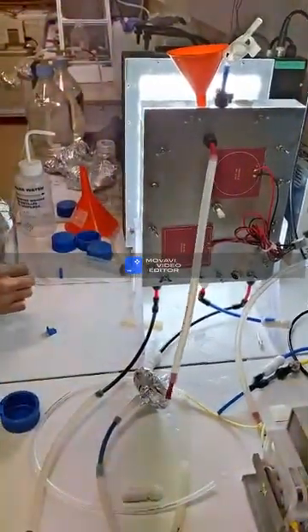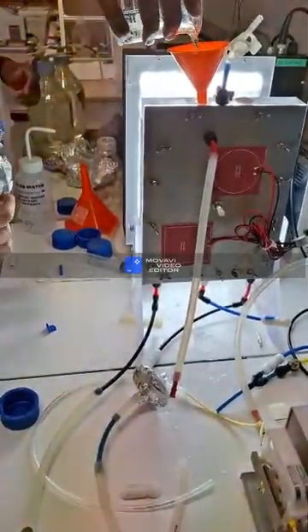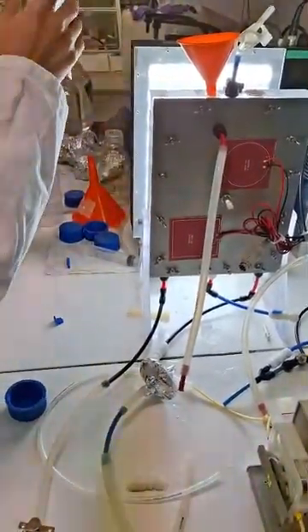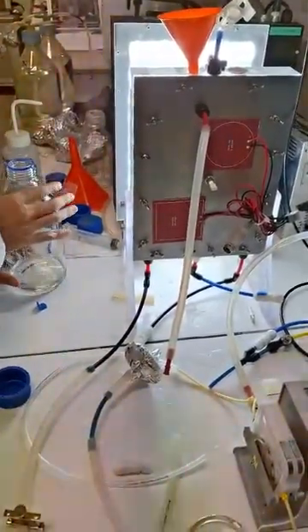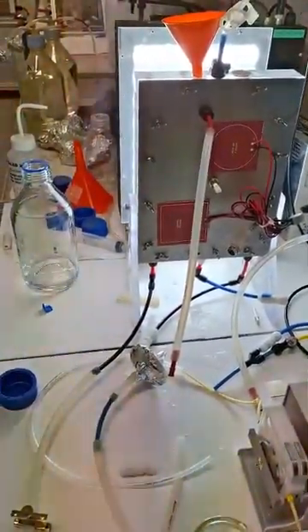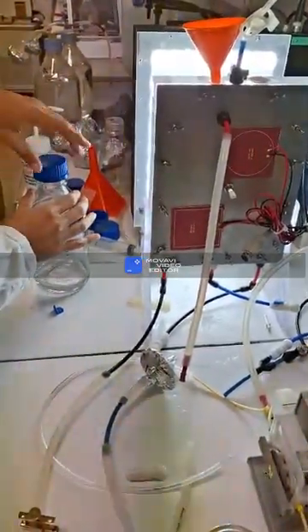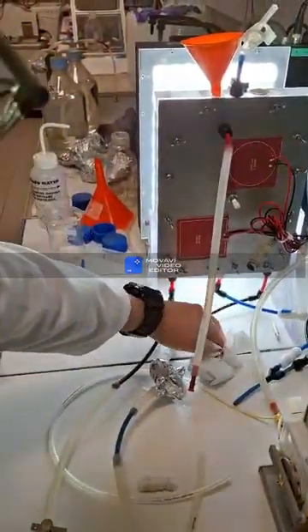I think you have to clean the area first. I will keep it here. Should I put all those? No, that's it for the moment. We will complete it just after, because we will have to put some air to homogenize during the sterilization. So we will do it now. Yes, thank you.